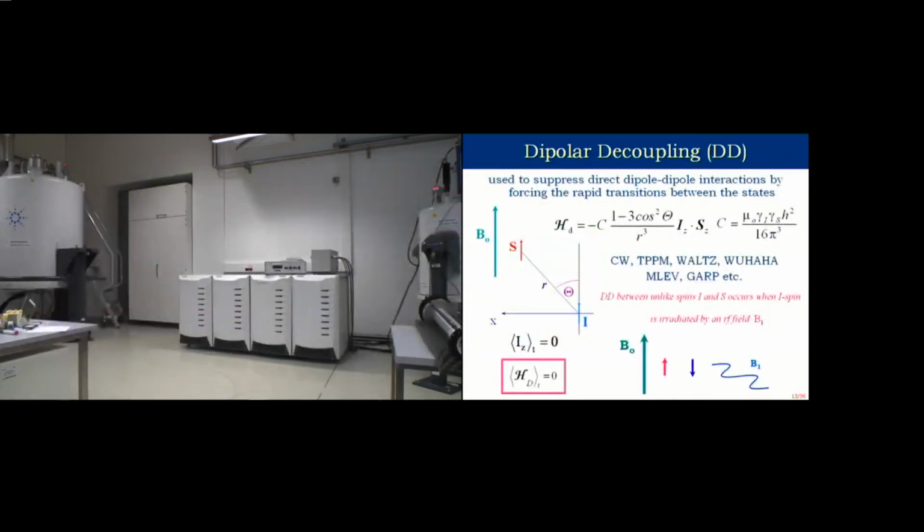So, what is dipole-dipole interaction? We know dipole-dipole interaction describes the situation when two spins interact through space or through the bonds, and one influences the second one, so the frequencies change for both of them. Therefore, both of them have different Larmor frequencies and can be observed in NMR spectroscopy at different positions.